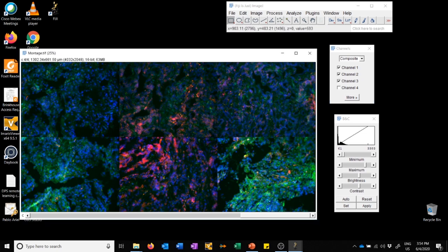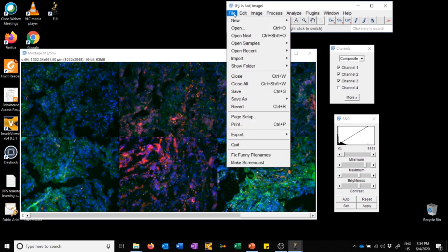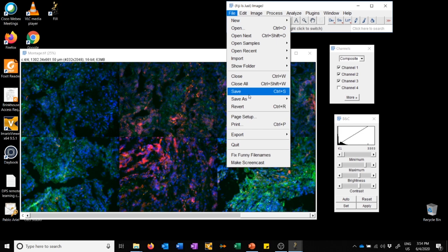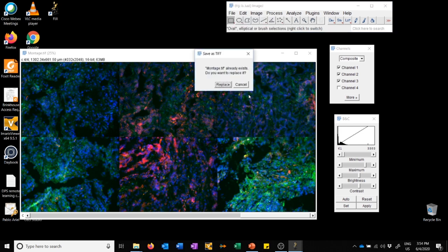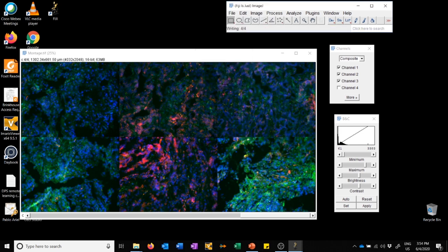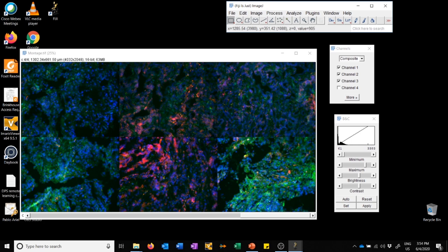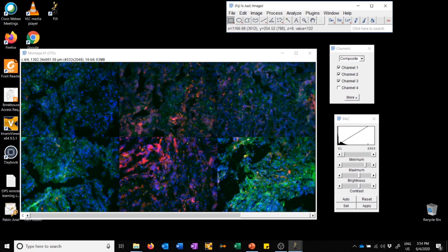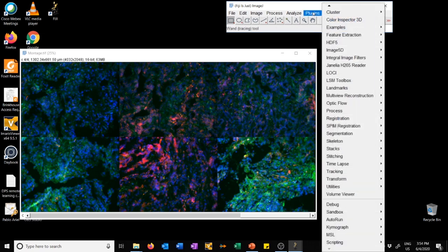Once we're done adjusting the settings, what we need to do is save this image, overwrite what it was before. So I'm going to go to File, Save. We haven't changed the data, but now we've embedded these display settings into this image. The reason this is important is because the next macro we're going to use is going to take the information from here and then apply it to all the images, but make images in a format that you can easily share with your colleagues.